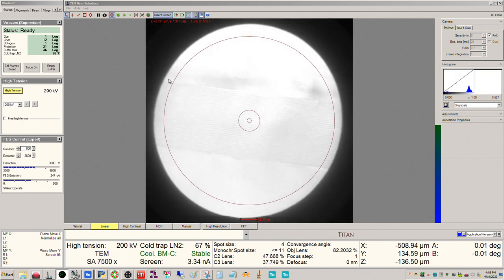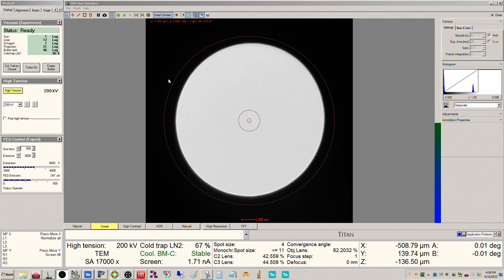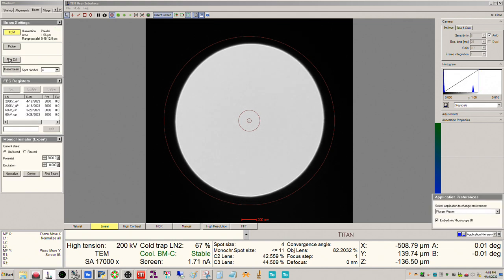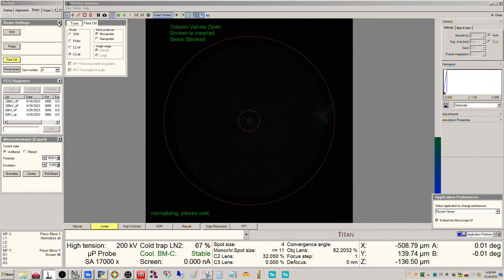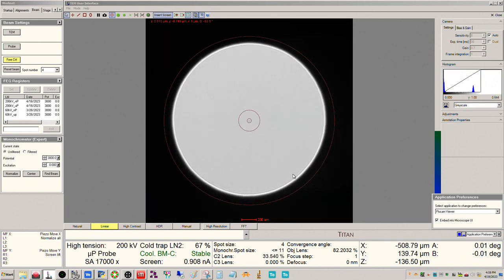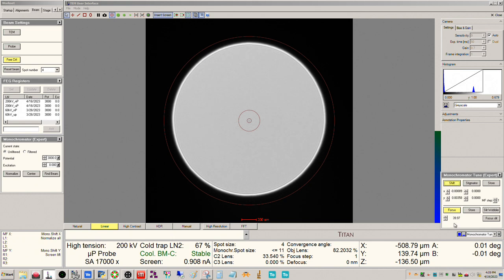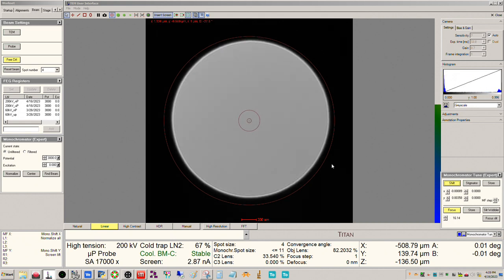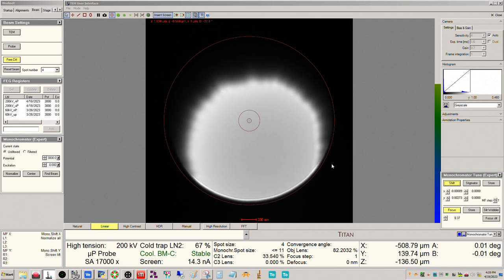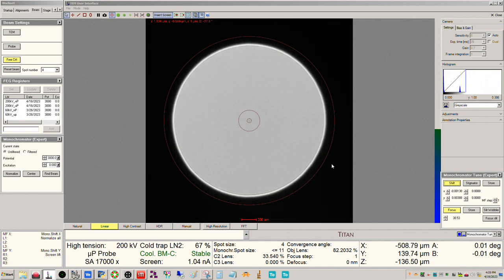All right, so things we need to do here. Let me quickly check the monochromator shift and the C2 aperture. So go to beam, turn off the C3 lens. Okay, I don't have my monochromator tune there because I have the wacko thing with the screen resolution, so I'm going to find it here. Okay, so we want to start at a positive 40 because we're going to be in STEM nanoprobe to start with here. So I'm going to make sure I'm centered. We're not too bad, but we're off a little bit, so I'll go ahead and tweak this. And perfect.